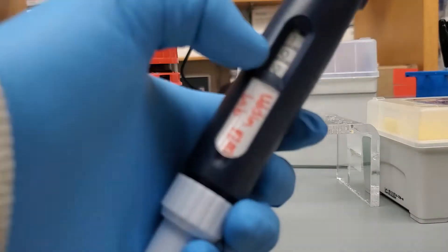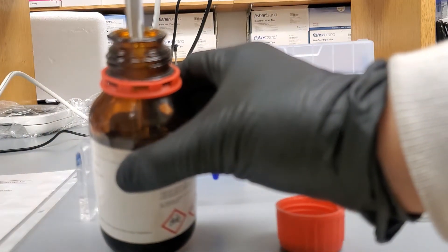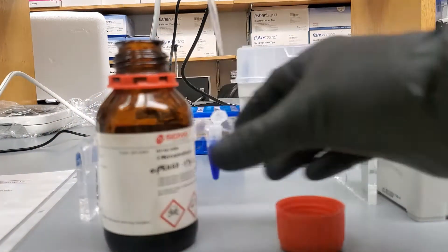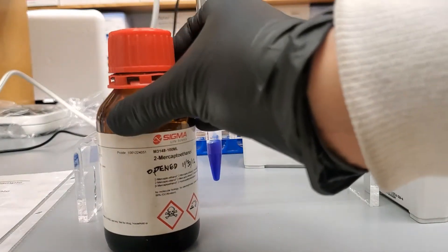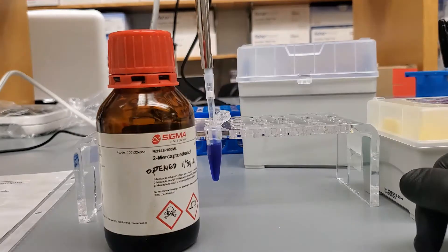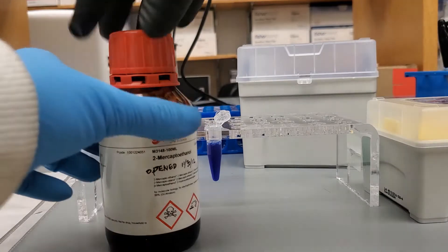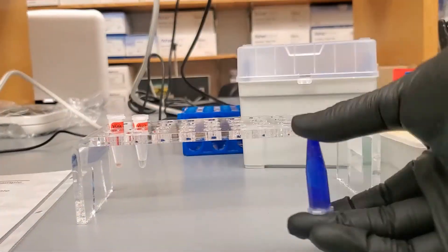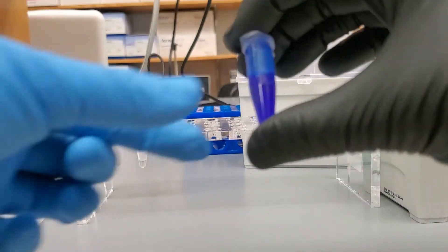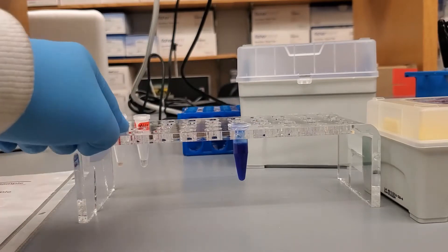I already have my pipette ready. If you're sensitive to the smell of beta-mercaptoethanol, you can go ahead and do this in the chemistry hood. And that's it — just invert it. And then we have our Laemmli ready to go that we're going to add to our samples.